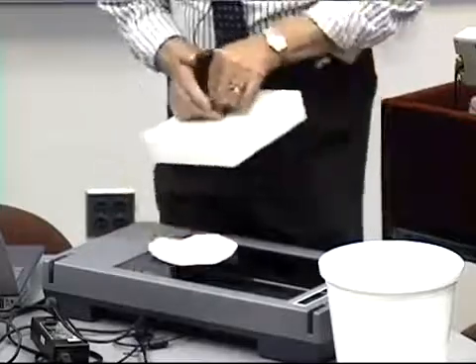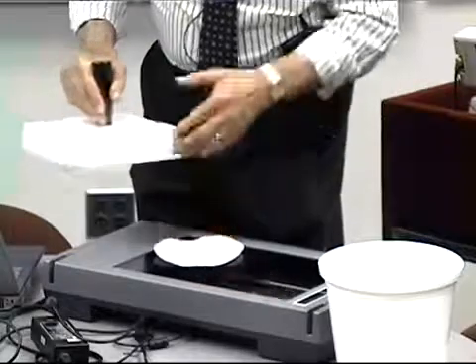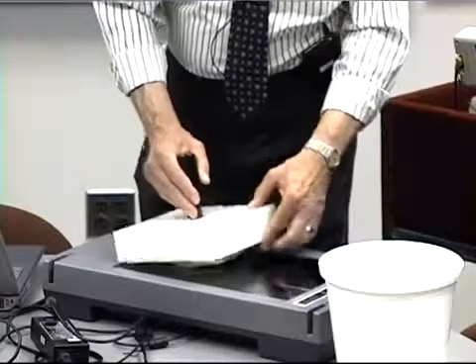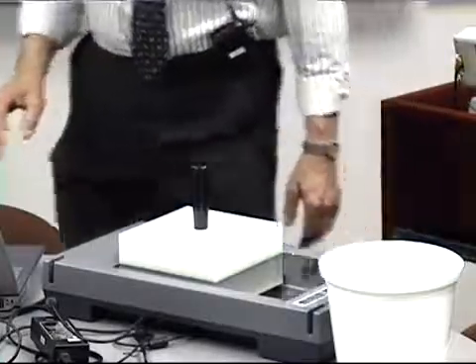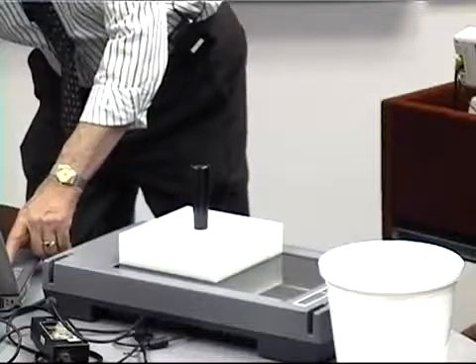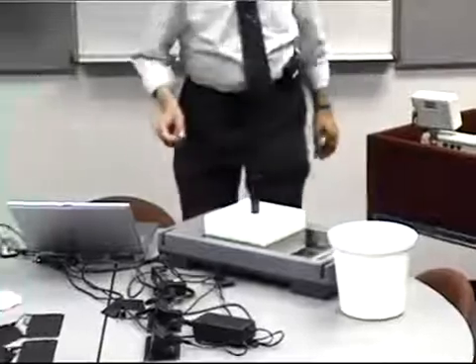We put it on the scanner and position it the same way each time. This makes it easy. And we put the block on and very simply place it. That is all that is involved with the measurement. We can then cause the scanner to measure or to take an image of it, and away we go.